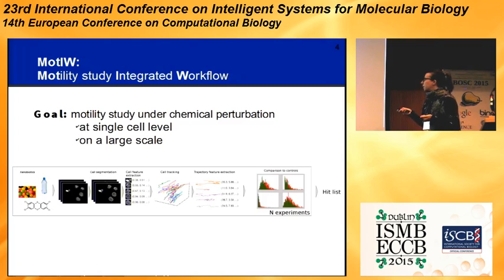These trajectories themselves will be described quantitatively. So for example, we're going to compute the mean square displacement of the cell on its track. And finally, we will use all those feature distributions to assess if single cell motility was significantly different in the experiment from the control videos.